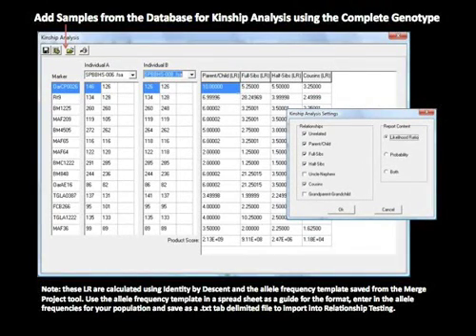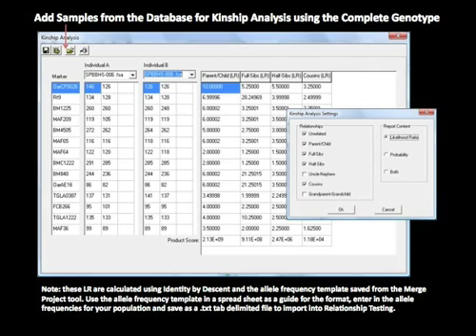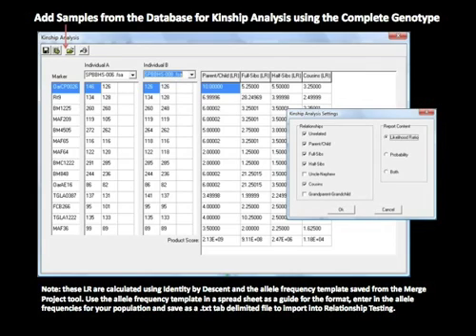The results of the Find Family database search are the files with the highest score for a given relationship level. To make a comparison between two files for all relationship levels, select Kinship Analysis from the Tools drop-down menu, add the samples from a current project or the database, and select the desired relationship levels. The resulting table may be copied and pasted into an existing report or saved as a text tab-delimited file for spreadsheet use.